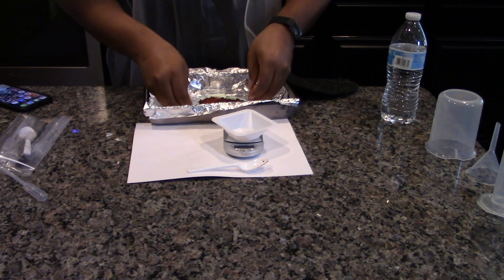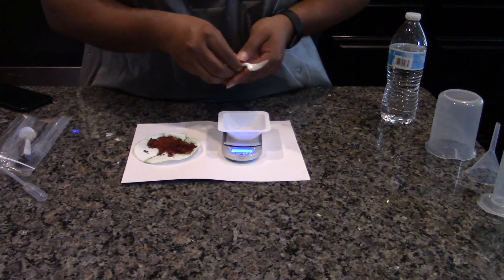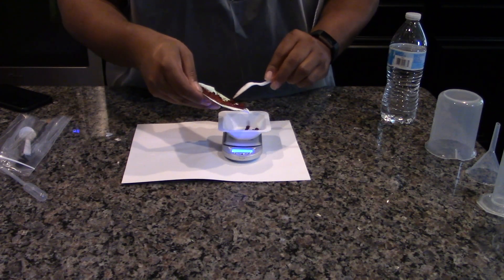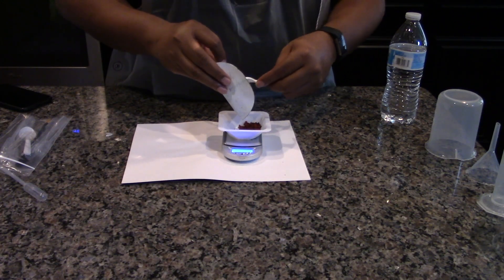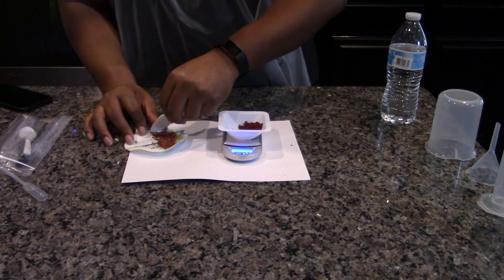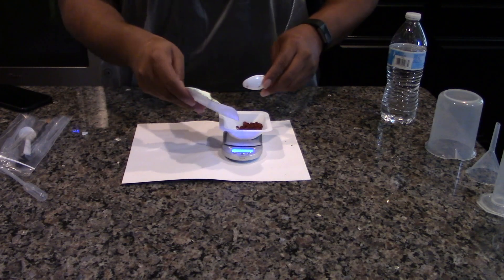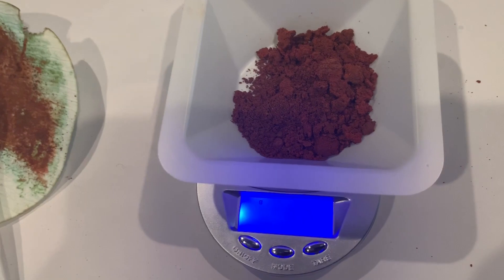Remove the copper metal and filter paper from the foil and allow it to cool a few minutes. Tare a weigh boat on the electronic balance. Transfer the copper metal from the filter paper to the weigh boat. Weigh the copper metal and record the mass in the data table.